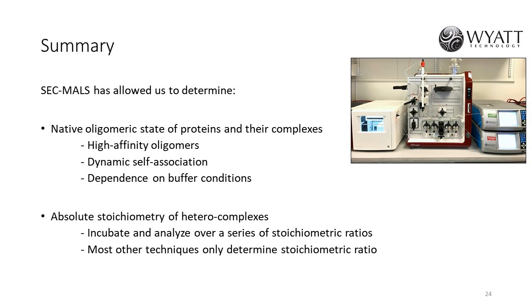Why is there a peak of H2A, H2B, and not H3, H4, when histones are present above an equimolar ratio in the SEC-MALS chromatogram? Yes, we see that when we add the H2A, H2B to our Nap protein, beyond the equimolar or relevant ratio, free H2A, H2B come out in the column as a peak. But with H3, H4, at least the wild type, to the highest titration point we added, all was bound to the Nap protein, which resulted in higher order oligomeric complexes.